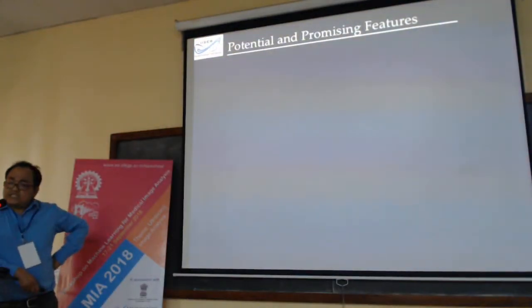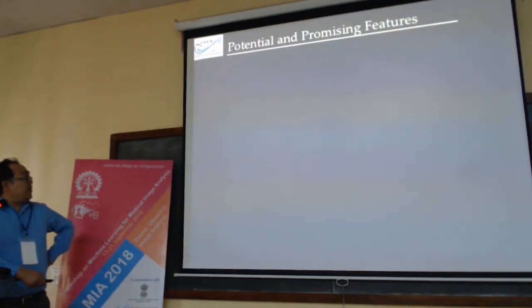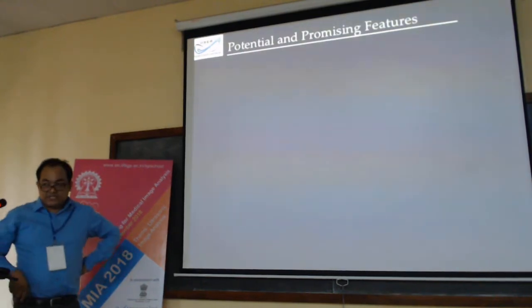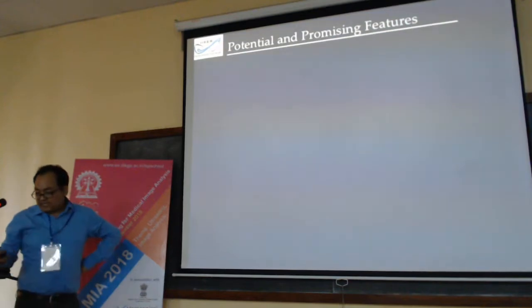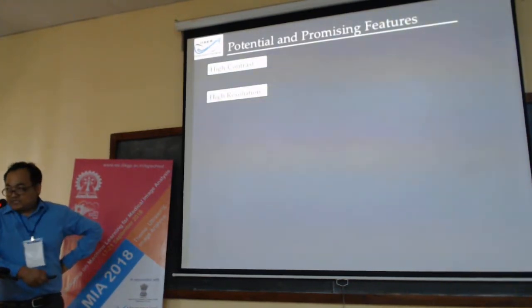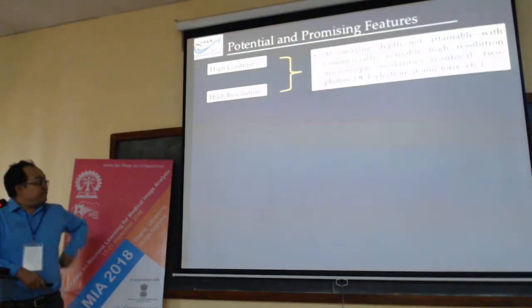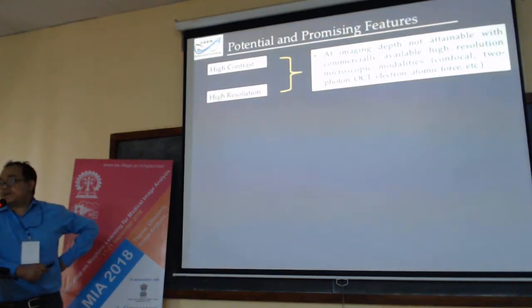This widely studied and rapidly growing research area around the globe is only because of the potential and promising features that photoacoustic imaging has. Firstly, it gives high contrast and image resolution at depth, not achievable with high-resolution microscopic modalities like confocal, OCT, or electron microscopy.